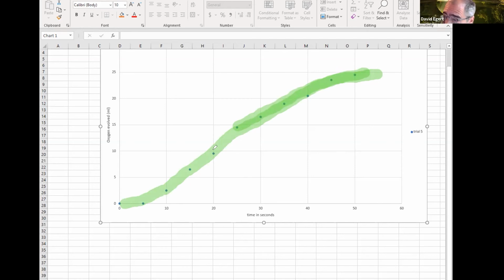So each of these dots could be higher or lower than it's really supposed to be, because those big bubbles were making things awkward. So I try to think about where the actual real curve is underneath the wiggle of the dots going up and down. Then I can say, okay, it's probably more like that, and draw my line.